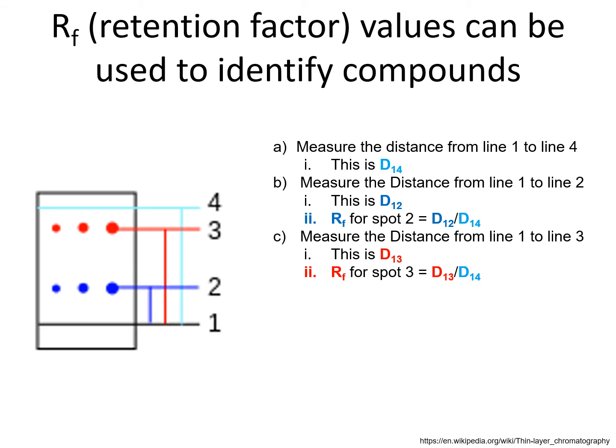And for this graphical representation of the Rf on the thin layer after the experiment, you can see that the spot with the blue color is the spot of the compound, whereas the line with a kind of greenish color labeled 4 is the solvent front.